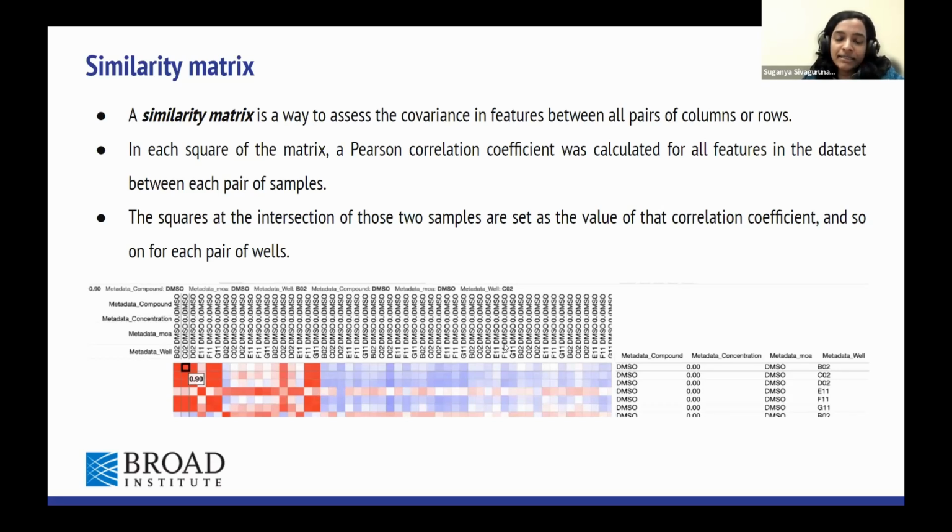By having a matrix like this, we'll then be able to associate what the correlations are between the different perturbations that you get from a multi-well plate. Again, I keep saying multi-well plate, but this can also be done for other kinds of experiments as well.